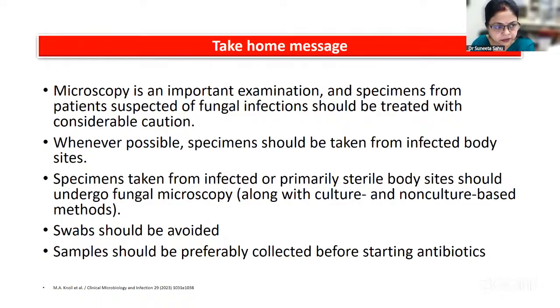In literature it has been mentioned that if organisms have been exposed to antibiotics, their cell wall deteriorates, their cell wall gets destroyed, and if the cell wall is destroyed, it will not take up stains and it will not be visible. And even if it is visible, the gram positive may look like gram negative. So these are the few things which we should know, and we should be a guiding factor for the clinicians when they are sending samples to us.